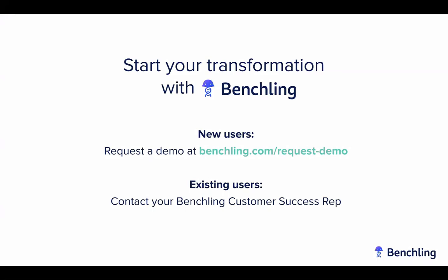Another question: can you order oligos, guides, dsRNA from synthesis companies like IDT? There's no native ordering button inside of Benchling, but what is commonly the case is that people design constructs inside of Benchling and then go to a synthesis provider like IDT and order them. Benchling and the molecular biology suite offer a variety of export functions. So if you wanted to export your primers, for example, to a CSV file and then copy those over into IDT, you can do so pretty easily.